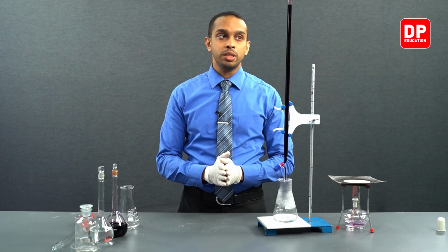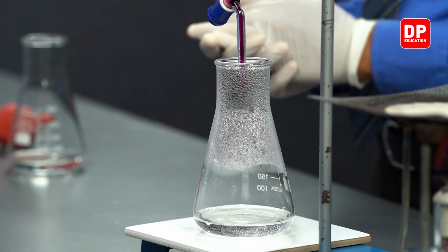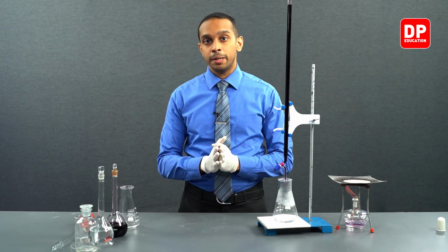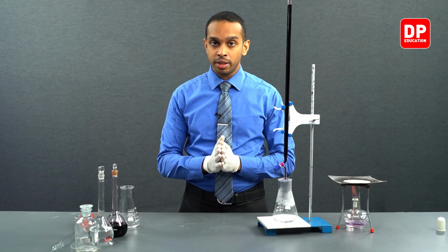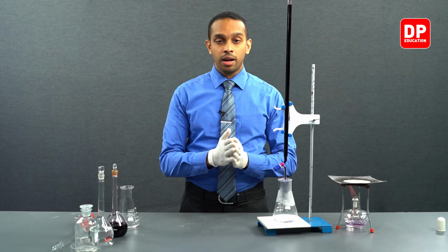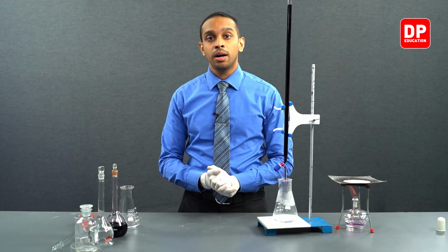Now, you might have noticed that I started adding potassium permanganate rather rapidly. The reason for that is because now, since we have done our first titration, we have an idea where our endpoint would lie. Our endpoint for the first titration was obtained at 31.6 cubic centimeters of burette reading over here. So up until that point, without any hesitation, we can add our potassium permanganate solution onto our titration flask.